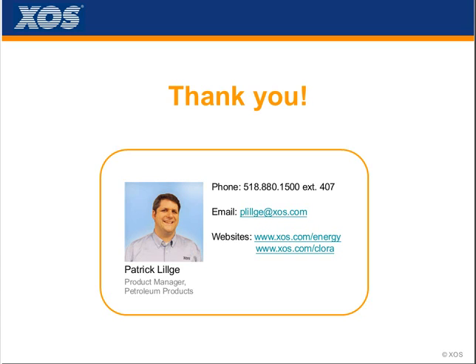I do have a question about the Maxine. I know we didn't talk about that here, but I'd be happy to briefly touch on what it does, and maybe we'll send you the presentation we did last year. But the Maxine is multi-element. It does about 30 elements of interest to the industry. Typically, low-level nickel, vanadium, iron, calcium, zinc.